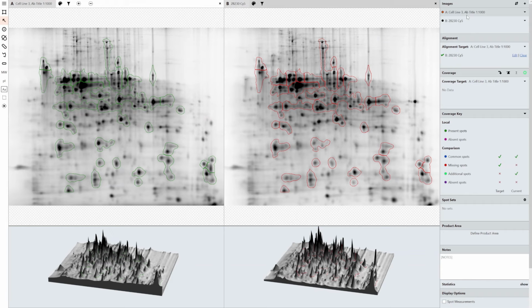Now, SpotMap is not just designed for 2 images. It can handle basically as many images as your computer can handle. Around 8 is where the performance starts to drop off, and I'm only using it on a laptop here, so I'm not going to attempt to try and open 8 large format images all at the same time. But yeah, the software has no hard limits. You can do what your hardware can support. And that's when being able to rename your images but not rename the file is going to be really, really useful if you're constantly switching between these different images, which ones you've got on display, which ones you haven't, things like that.